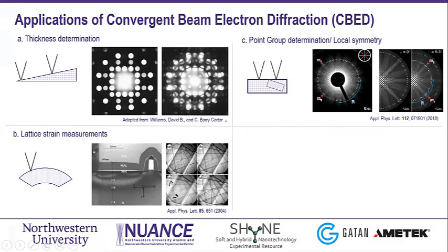Also, local symmetry. This was very widely applied, a very wide application for convergent beam electron diffraction.